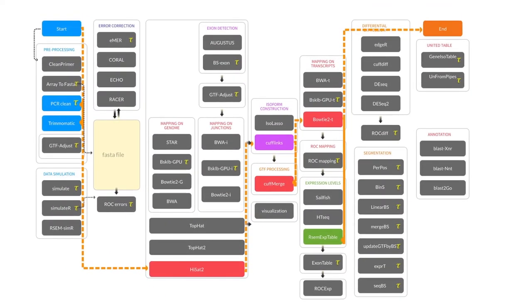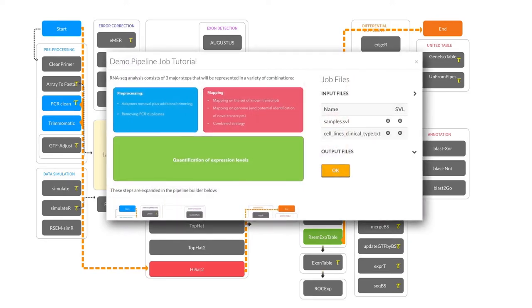We have already done a few exercises on the tBion4 platform, where color-coded buttons represent methods of analysis starting from pre-processing, like Trimmomatic and PCR-Clean, onto different mapping strategies like HiSat2, CuffLinks, CuffMerge, and Bowtie, and finally quantification with RSEM, HTSeq, or Sailfish. If you practice this several times, you will find that different combinations of methods provide different pop-up screens where you can learn about inputs and outputs for each step and find publications describing each method in detail.